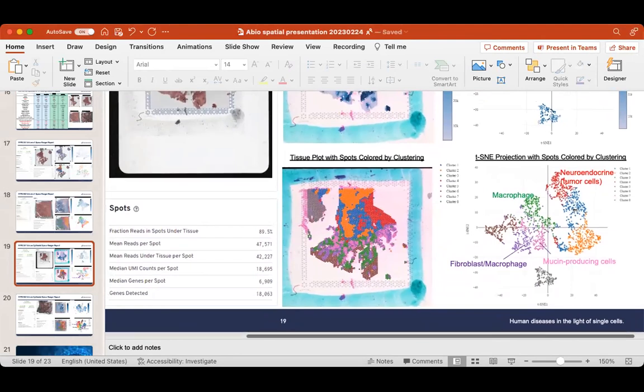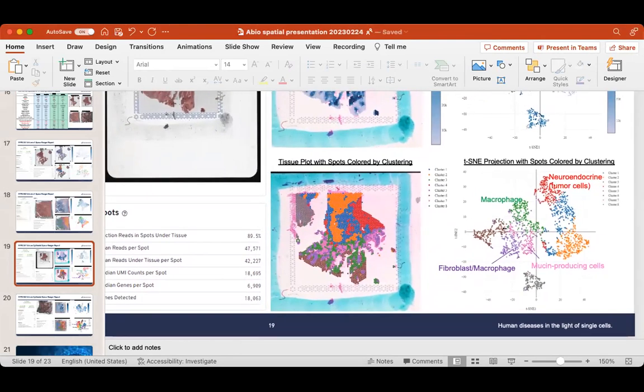Yeah, Linda, this is actually not cells, it's spots. It's a cluster by spot. So it's not a cell type. If we really wanted to know the cell type, we still need single cell data to deconvolute the result. But it's good. Very interesting, if you can do the same cell by spot, you have another layer. Yes, so this is what Nassim is going to talk about.